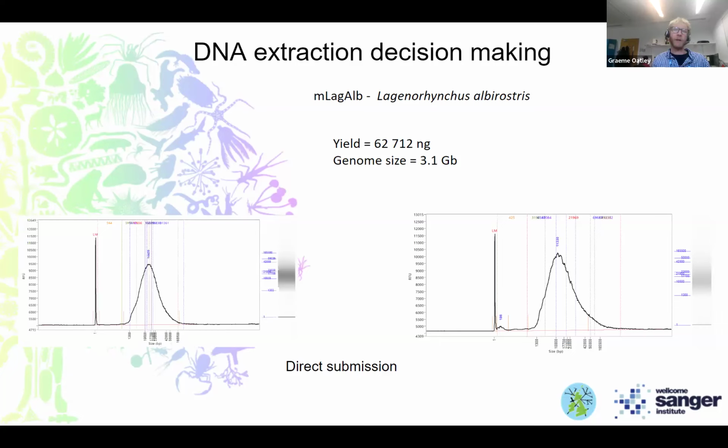And so an example of the output of this after a SPRI is we've been able to get rid of some of the low molecular weight DNA and tighten the peak a little bit, and you get an average fragment size, I think it's close to 11 kb. So slightly lower than we would ideally want for low input fragmentation, but you can see the mode of our DNA is sitting around 14 kb. So something that we think will work quite well with PacBio long read sequencing.